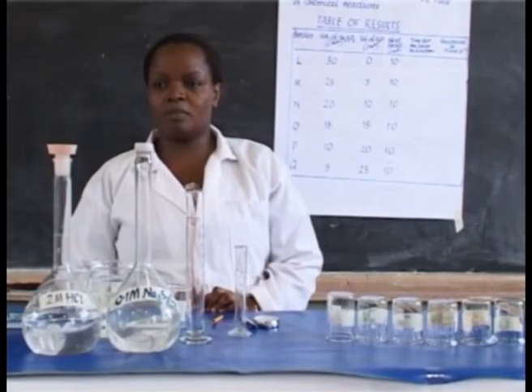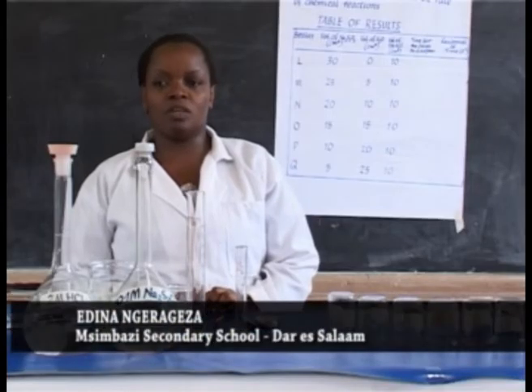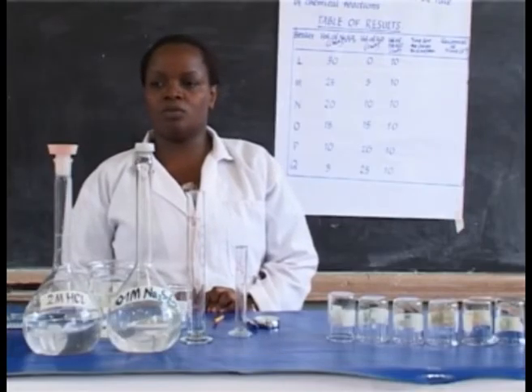The aim of this experiment is to investigate the effect of concentration on the rate of reaction between sodium thiosulfate and hydrochloric acid.